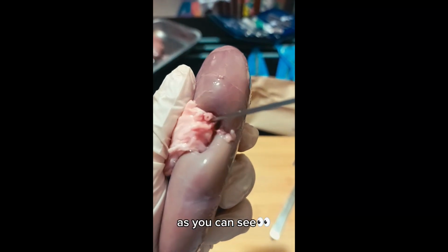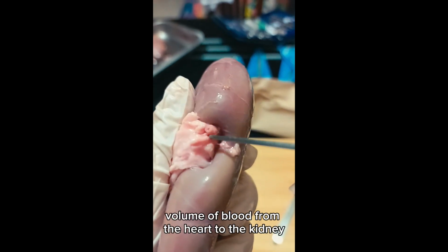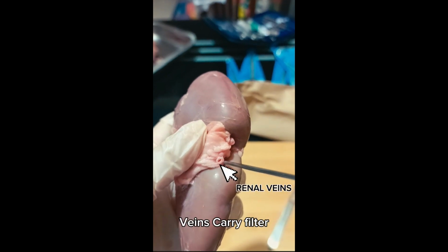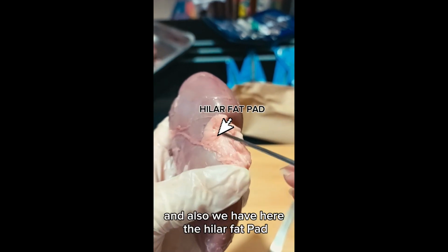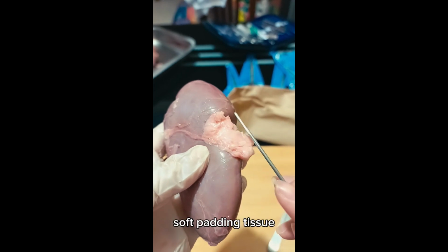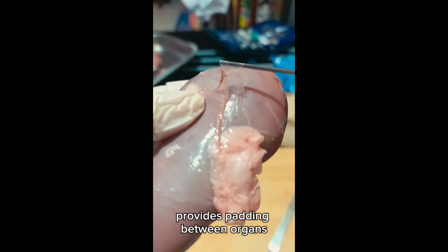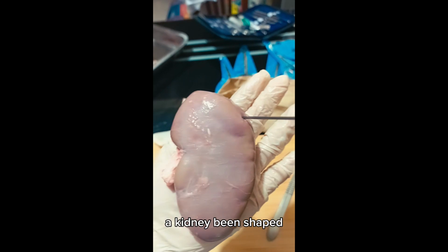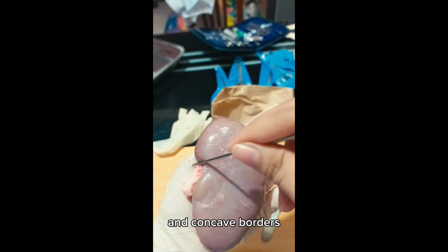As you can see, this is the renal artery. It carries a large volume of blood from the heart to the kidney. Next, we have here the renal veins, which carry filtered blood from the kidney to the posterior vena cava. And also, we have here the hilar fat pad. Soft padding tissue, fat cushions the body, provides padding between organs, and helps keep the body warm. The kidney has a bean shape with both convex and concave borders.